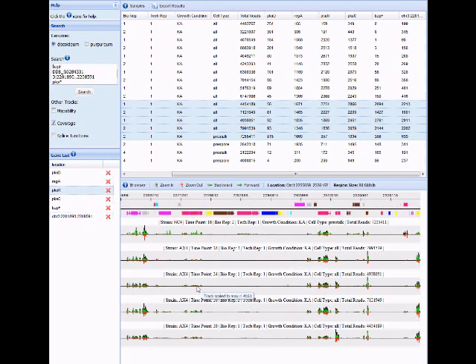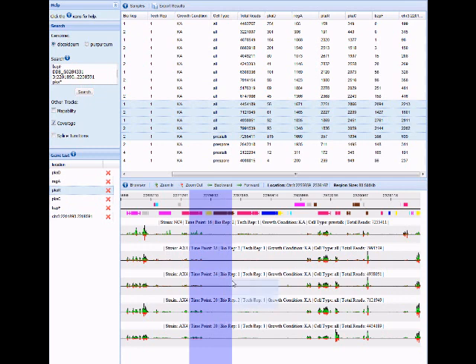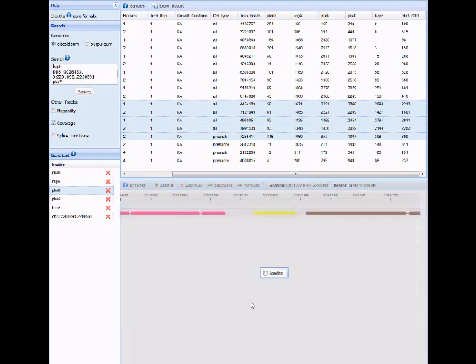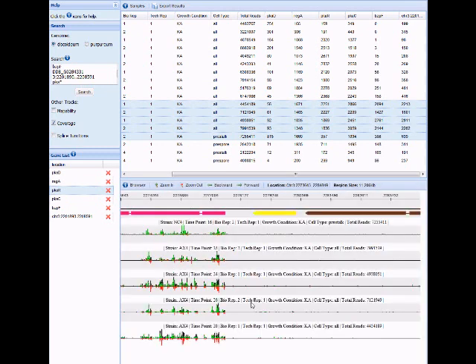To zoom in or to get the read counts for a specific region of the genome, you can hold down the Shift key and drag your mouse over that region. You'll get a pop-up where you can either get the read counts for this region or zoom in.